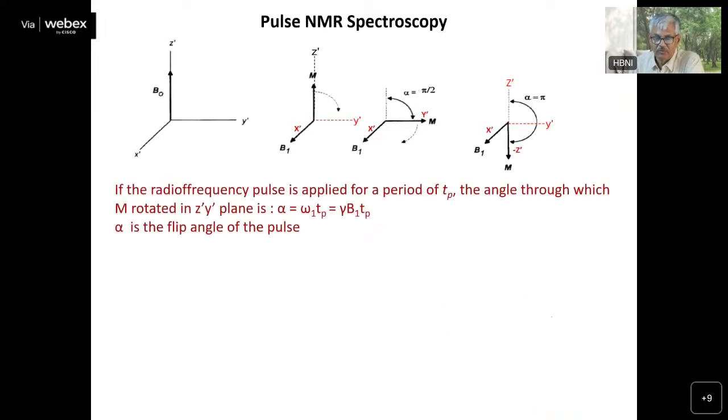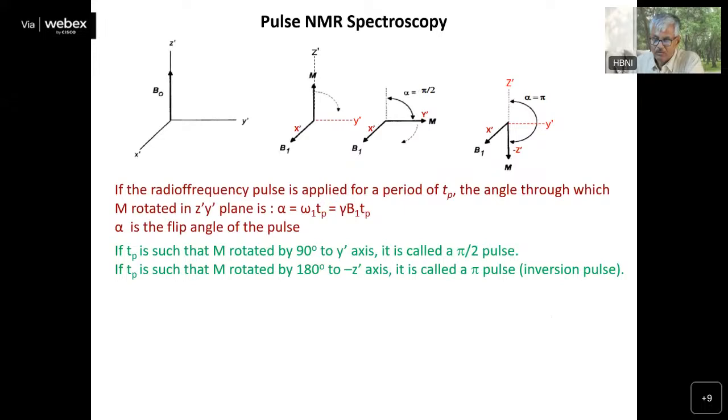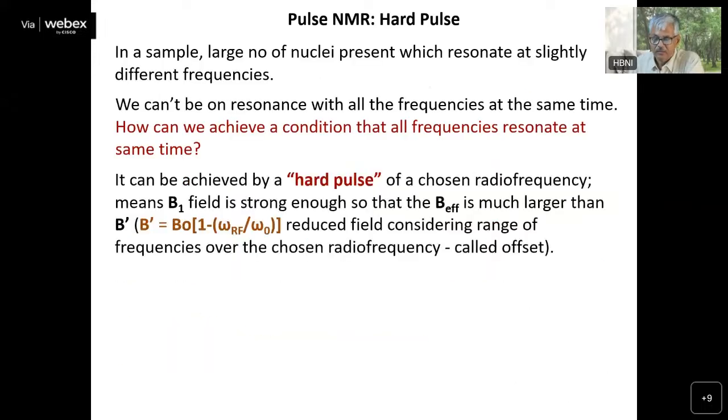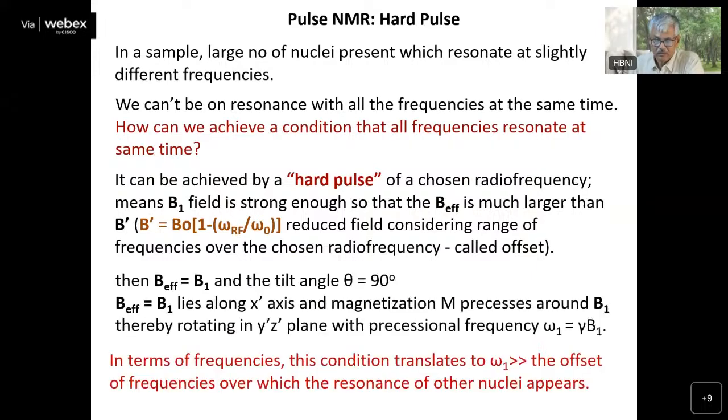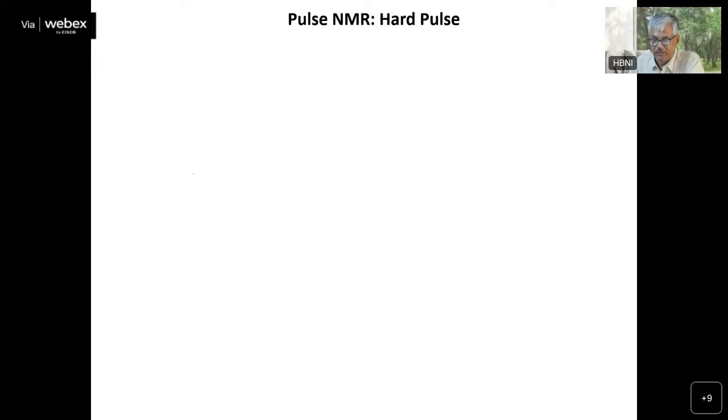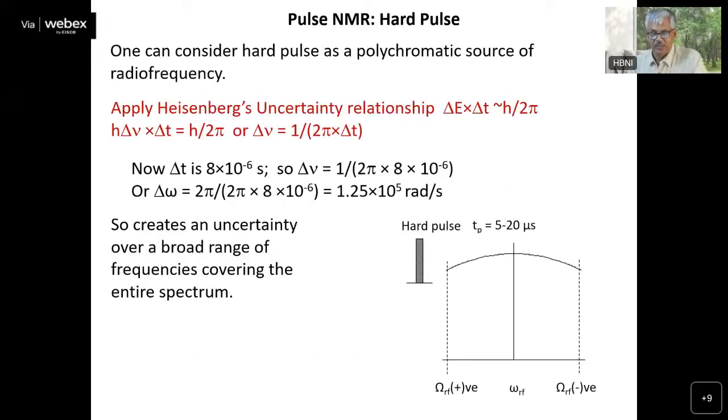This is an on-resonance pulse. This example I have shown you the other day, same thing. Now you can see, you need only around 2.5 kilohertz of uncertainty, but you are now getting around 20 to 25 kilohertz uncertainty.